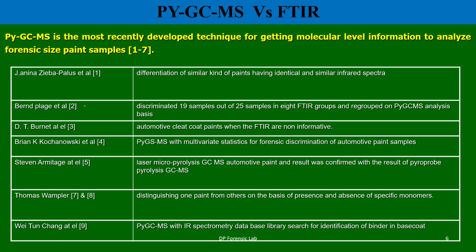So here, PyGCMS versus FTIR. PyGCMS is slightly more useful and very informative.